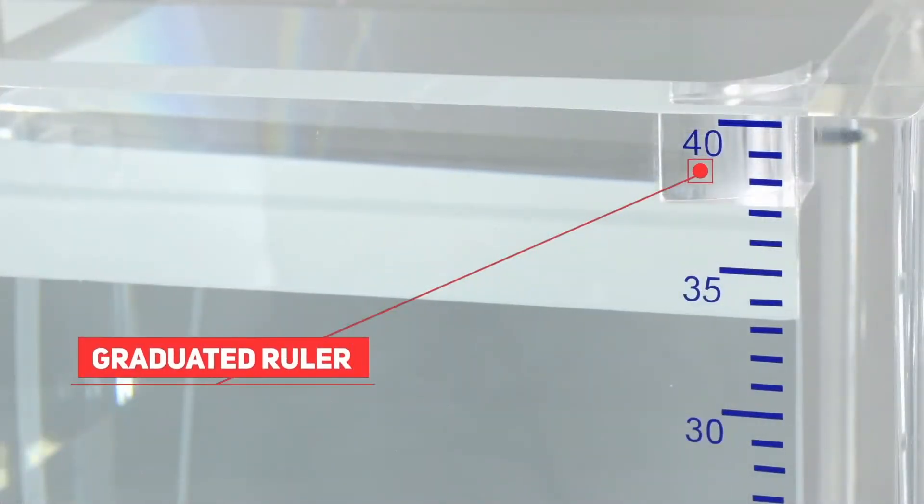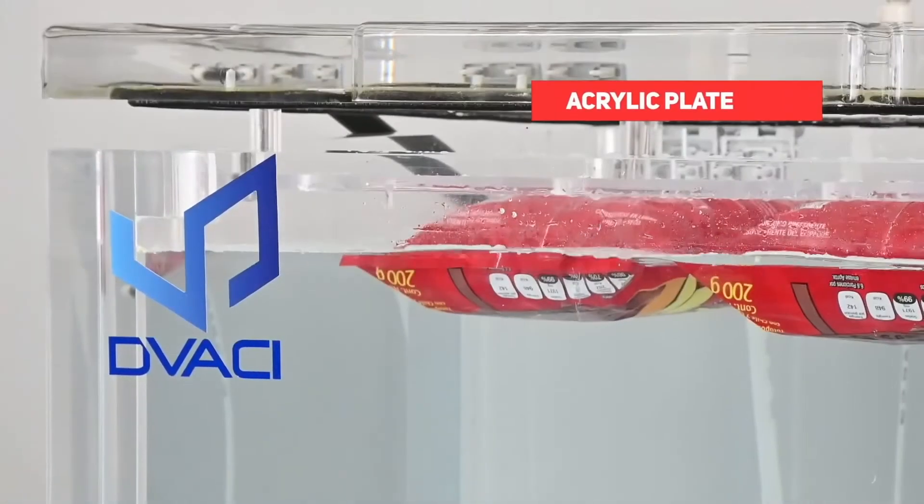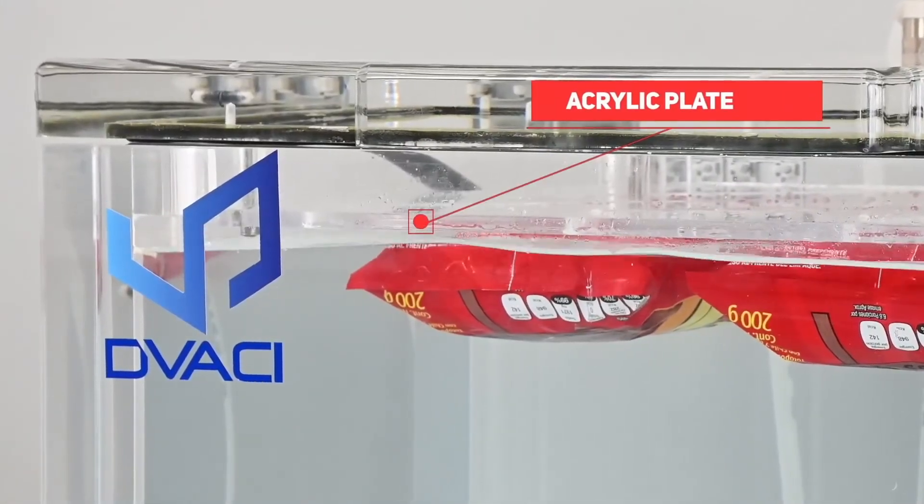Including a water level ruler, an acrylic plate for keeping samples submerged, and a drainage system.